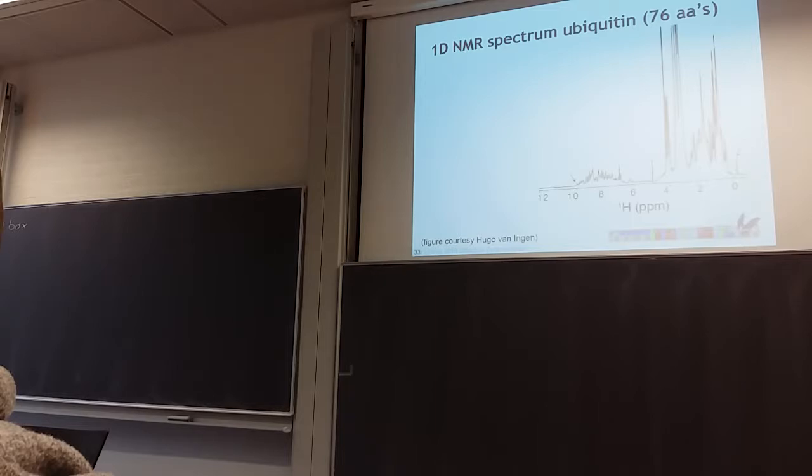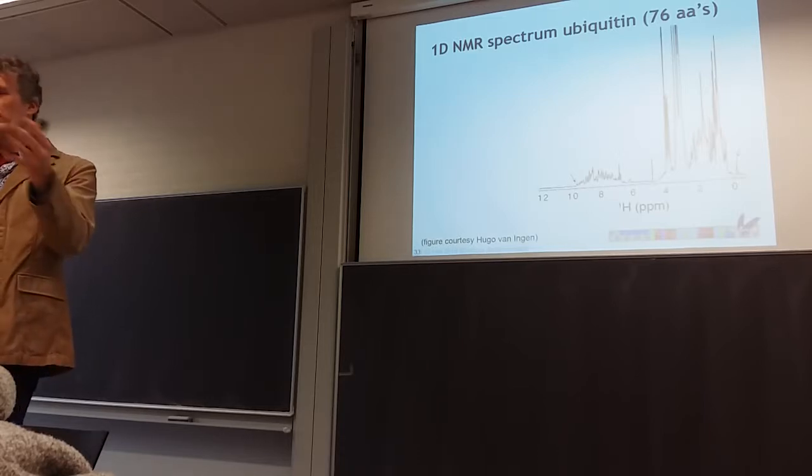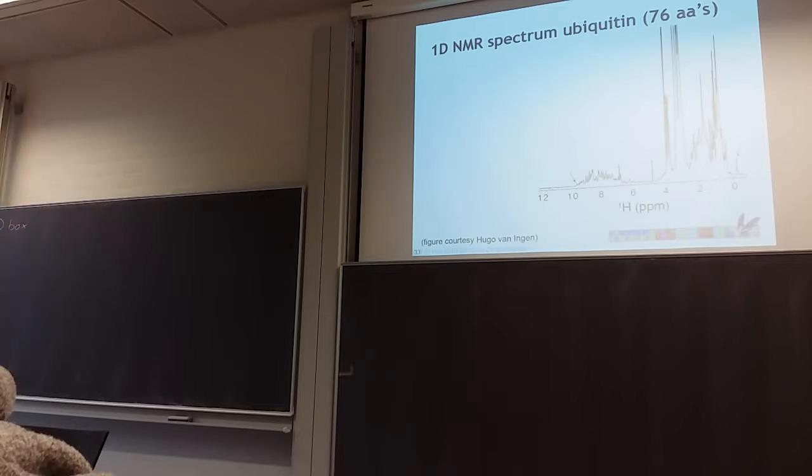Then there's chemistry that's playing tricks on you. So there's two protons in the backbone, right? Carbon proton and the nitrogen proton. The nitrogen proton actually exchanges with water. So if you put your protein in deuterium water, then it quickly exchanges with the deuterium. And since there's so much water and so little protein, you just lose it.